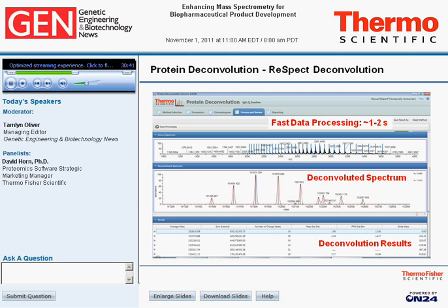And like I had shown for the Q-Exactive section, it'll also show the calculated mass for each of those charge states, and you can get an idea of how reproducible that mass is measured across the whole set of charge states. One more thing you can do is you can right-click on that table and export to Excel. So if you want to do anything else with that, you can.